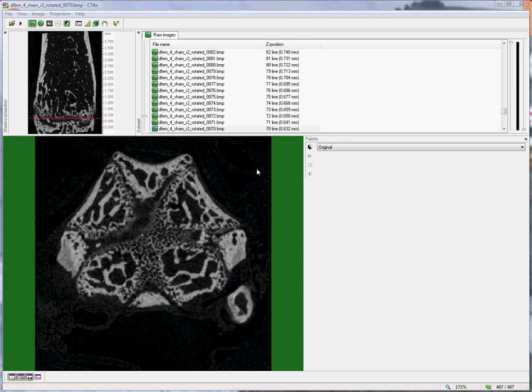The same method can be used also for the proximal tibia, and either for the mouse or rat bones. The principle is to use the growth plate as a reference, the same as in histology-based bone histomorphometry.